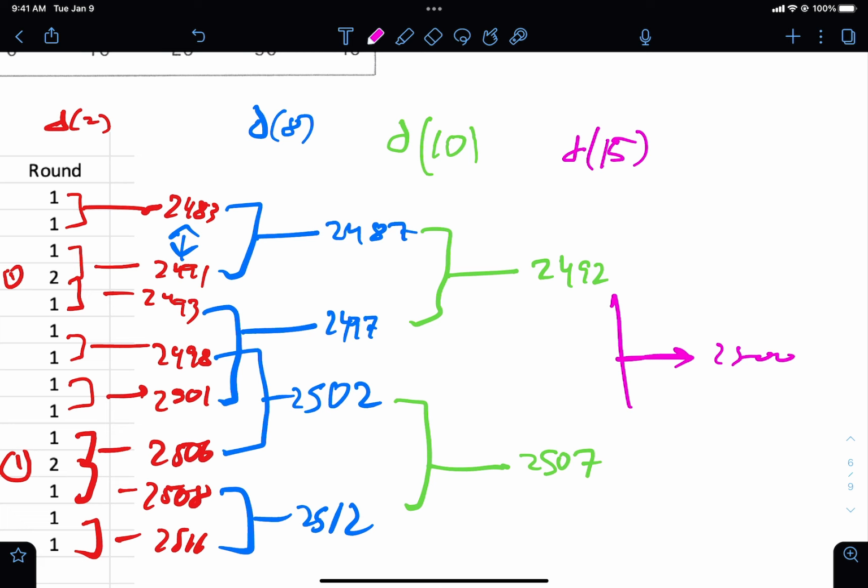Something like this almost always arises from stereochemistry, either through a chiral center or 2 chiral centers or a double bond in there somewhere, where you have cis and trans relationships. That's usually where you get these very complicated splittings. So we have a wide doublet of 15, then a more narrow doublet of 10, then a more narrow doublet of 8, and then a more narrow doublet of 2.